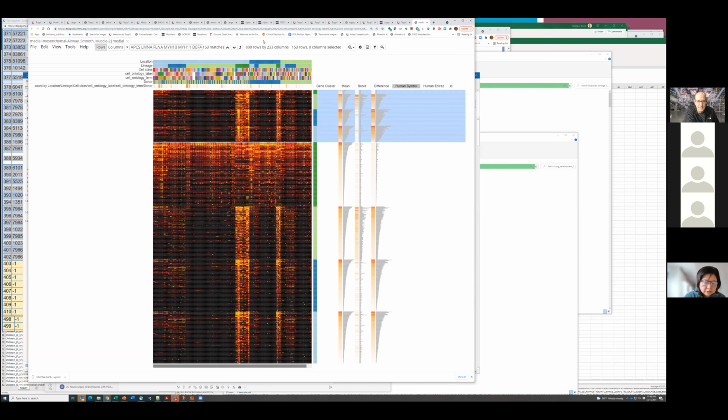And in terms of your ranking of the candidate gene, what is it mostly based on? Because you have such comprehensive metadata, I assume you have a different ranking system based on different metadata, right? Yeah. So here are three different significance scores about a gene within one of these modules.